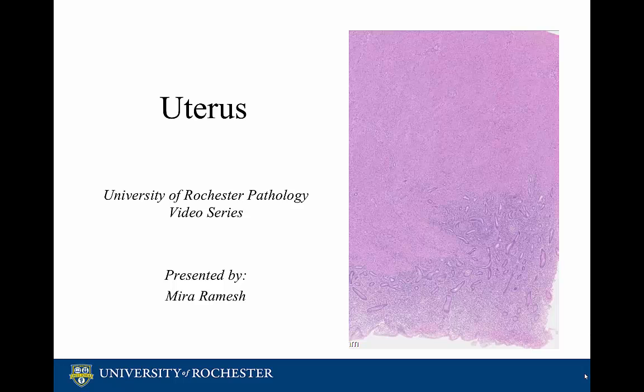My name is Mira Ramesh, and you are watching the University of Rochester Pathology video series. This video will discuss the basic histology of the uterus.